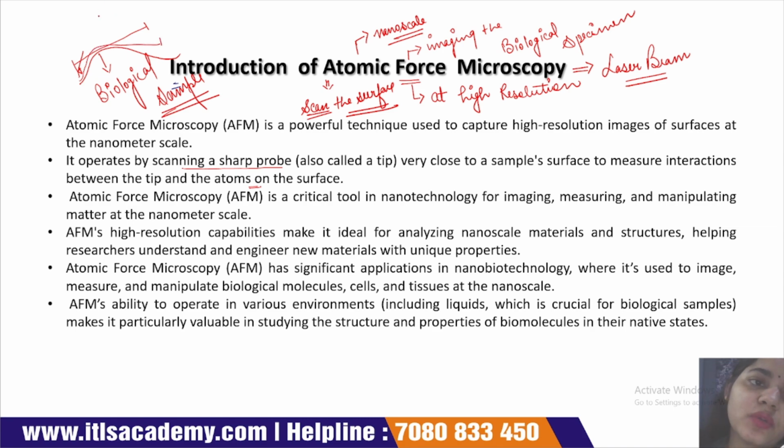In this microscopy, an image will form due to the interaction between the cantilever tip and the atoms on the surface.